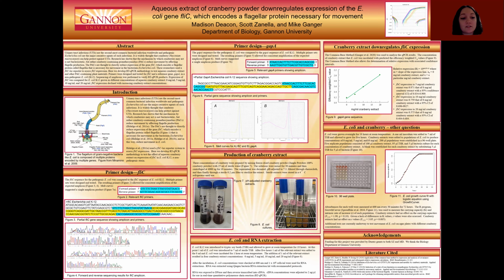In the bottom left, you can see our forward and our reverse. And that was able to give us the blue and yellow code needed in order to have the primers work for our K12 strain.